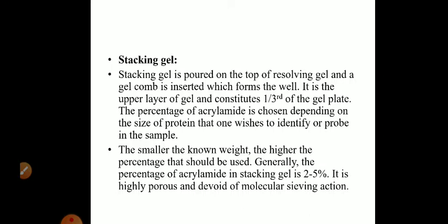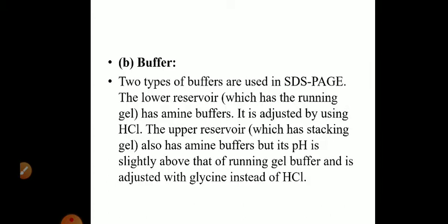So, pore size is very large. It is highly porous and devoid of molecular sieving action. So, there is no molecular sieving action. It actually allows all the protein molecules to reach the separating gel as a band.